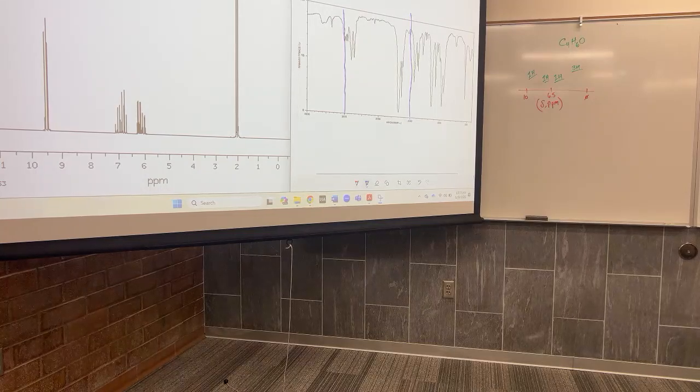Not quite. What it's not going to give us is this signal in the NMR at 9.5. There's a couple of pieces in the IR as well, and it just doesn't quite verify. Is that 3,000 line? It's in the right place, it's just not very well drawn. But you're looking for a signal that doesn't seem to be there? Yeah, isn't that the worst?